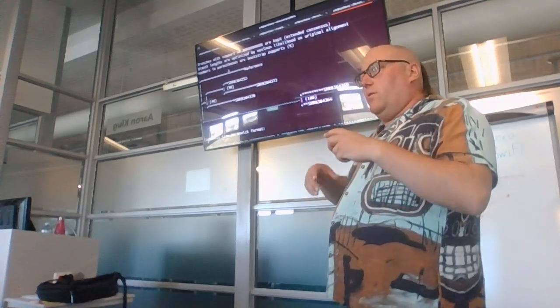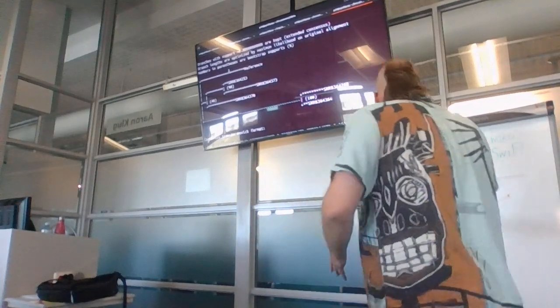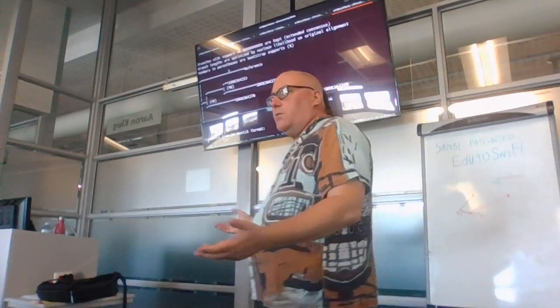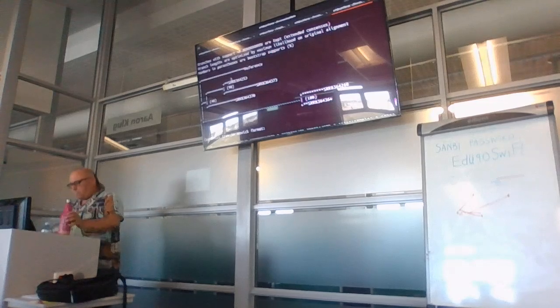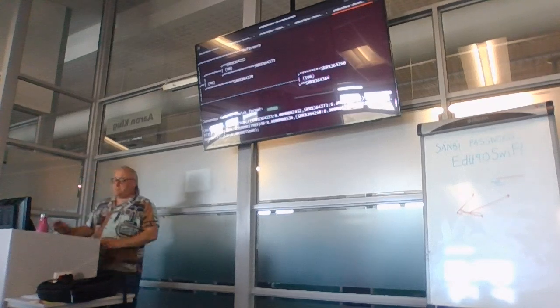But so if contamination and all of those kinds of things can extend branches with incorrect information, okay. So anyway, this is your phylogenetic tree. But let's also see what differences we have. Oh, there was a second question.